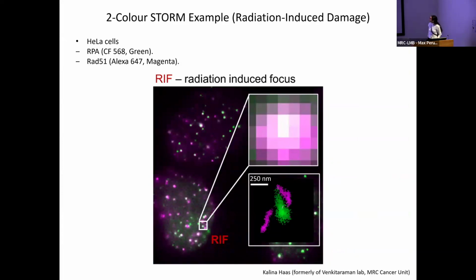And yeah, so this is just the last example of how you can resolve structure with storm microscopy. Here you have a diffracted spot with regular microscopy, where you have a structure that could easily be interpreted as overlapping if you are within the diffraction limit. But when you use super resolution microscopy, you can resolve those two molecules in your image, and you can see that they're not overlapping, but more like next to each other.